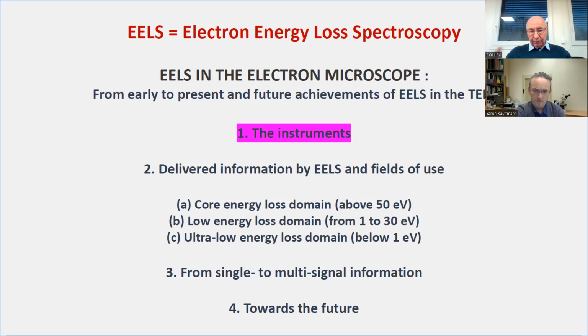So this is the plan of my talk now. I will discuss the instruments that we have used in Orsay for years, and then discuss in more detail the information delivered by EELS and the fields of use. This is the second part. Then we will move from what I have already indicated in this introduction, from single to multi-signal information, and at the end, if we have not too much time, a few words towards the future.